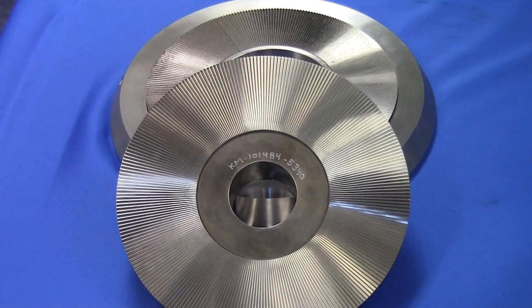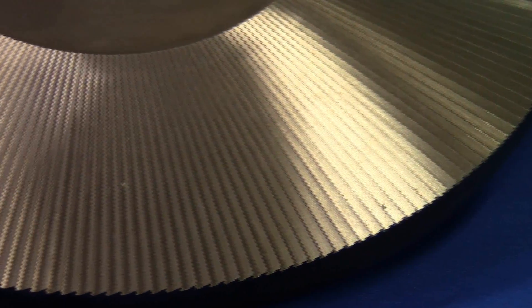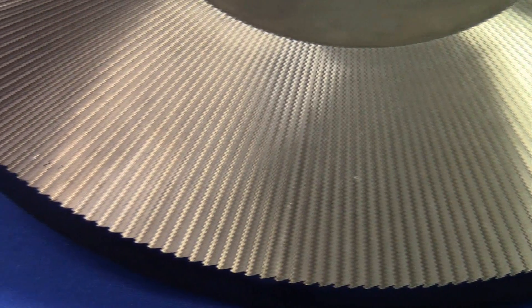The attrition milling system is our newest addition to the Micro UMP product line. It's capable of milling polymeric or heat sensitive materials.